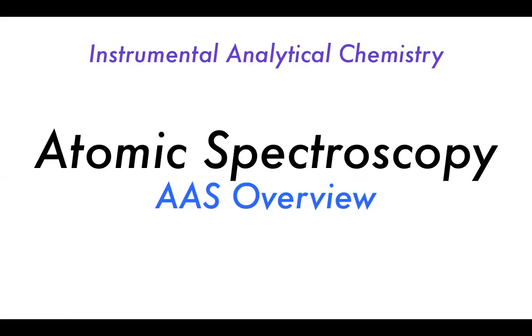Hello and welcome to this next session on instrumental analytical chemistry, where we continue on our journey to understand certain aspects of absorption, molecular spectroscopy, and in this case, today, other kinds of absorption spectroscopy in the form of atomic spectroscopy, where we'll be having an overview of AAS, which is atomic absorption spectroscopy.